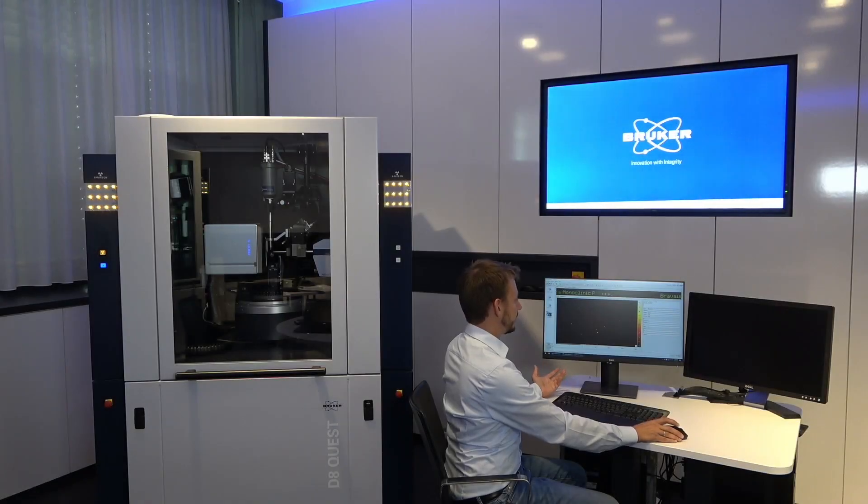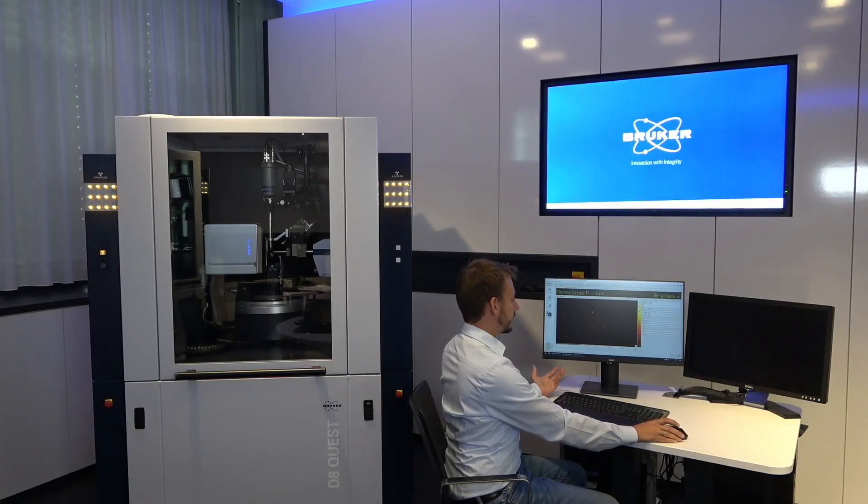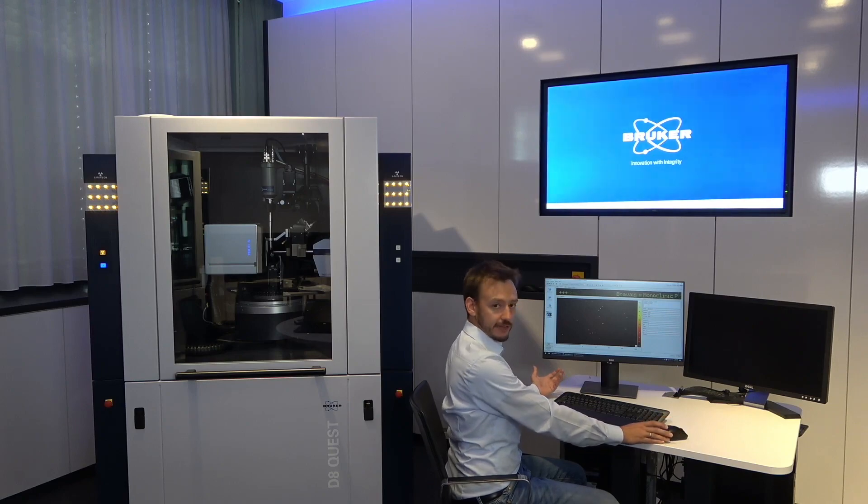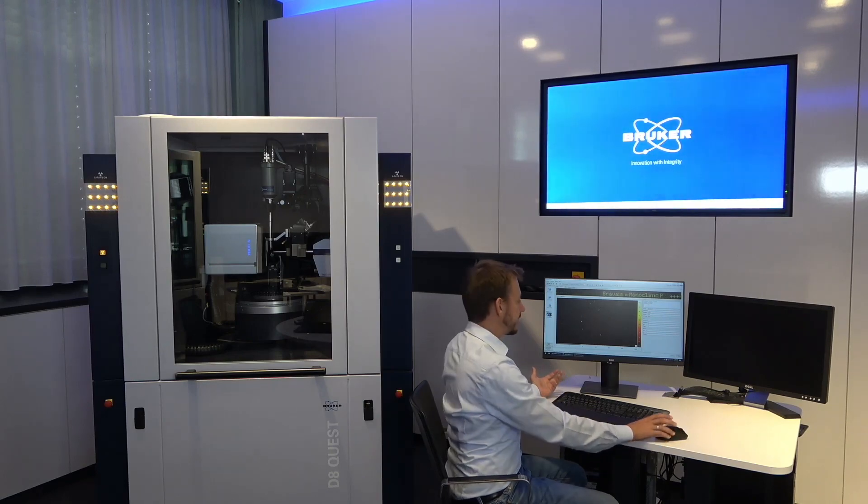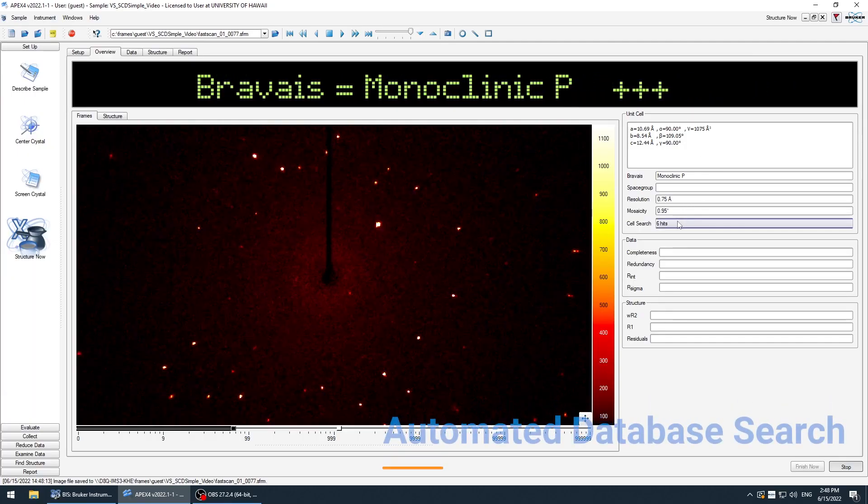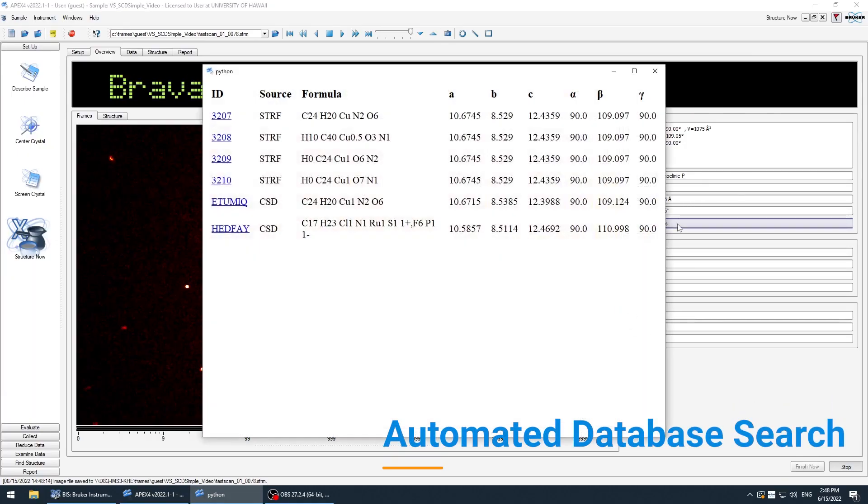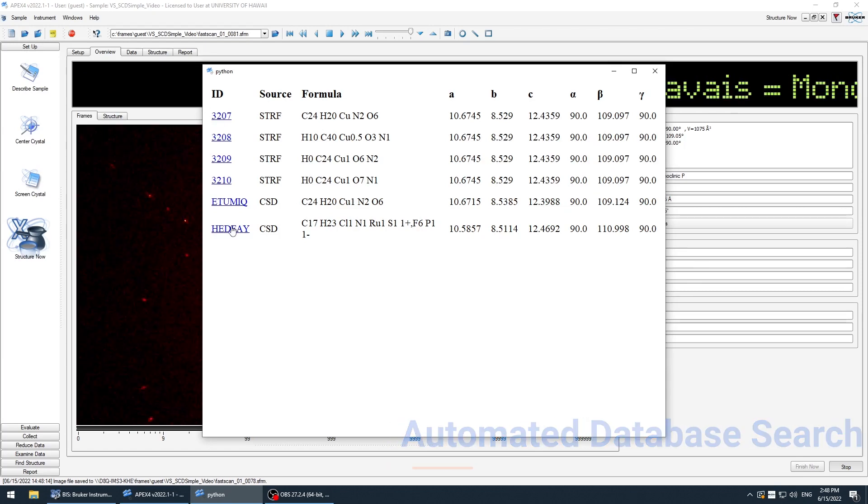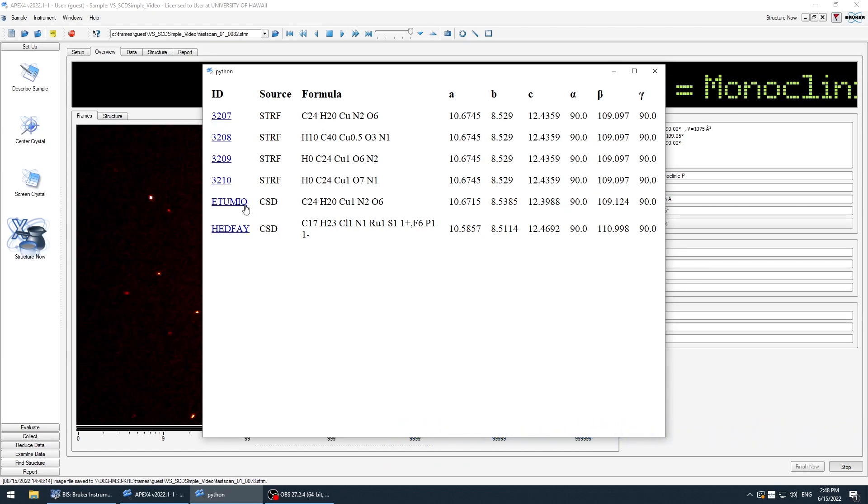There is already the unit cell. The software also automatically checks the databases. So you see here it found six hits, some internal hits of my database, and also the Cambridge Structural Database.